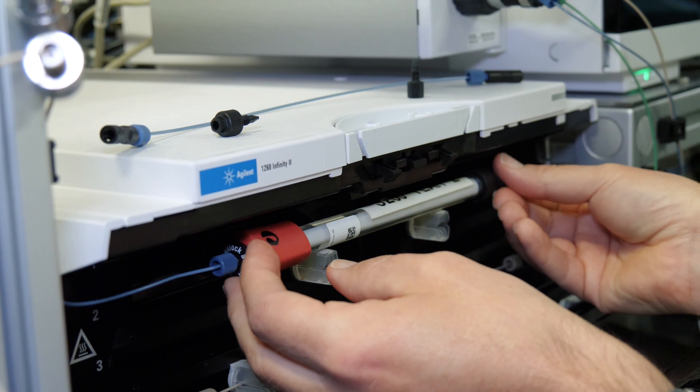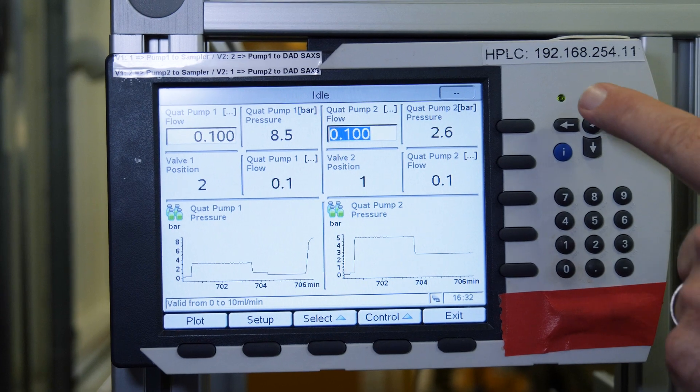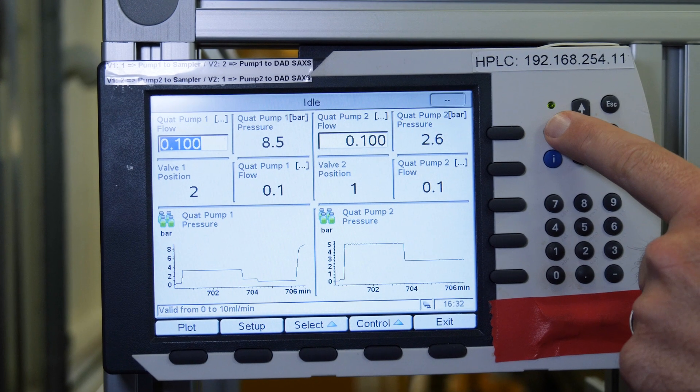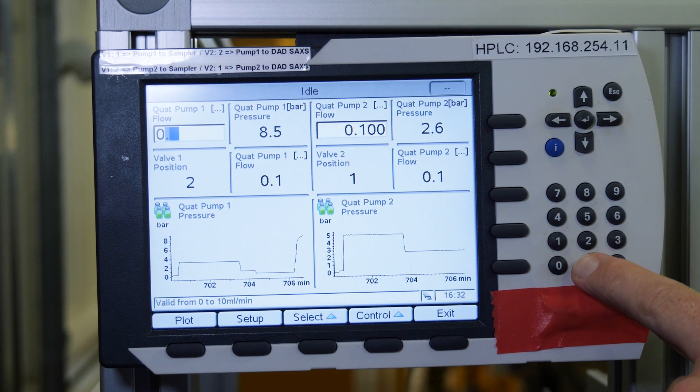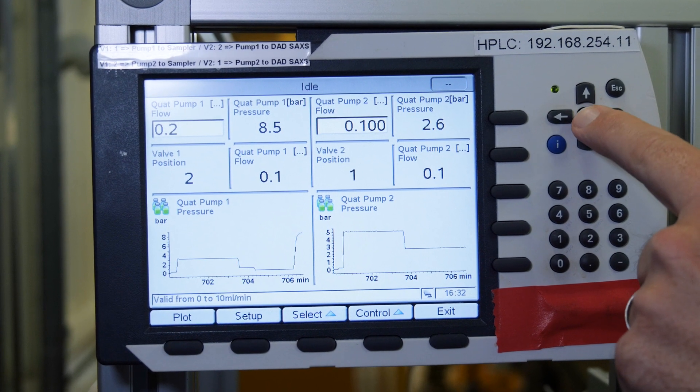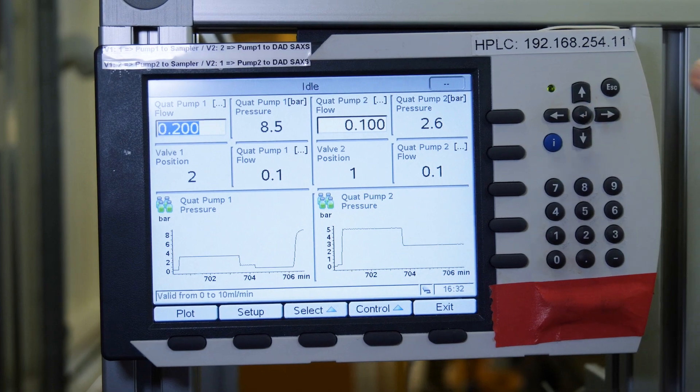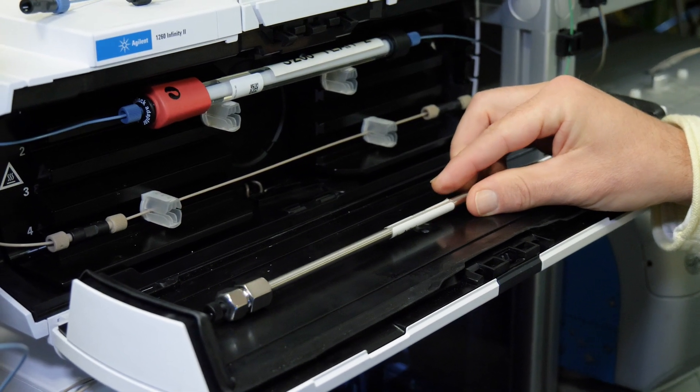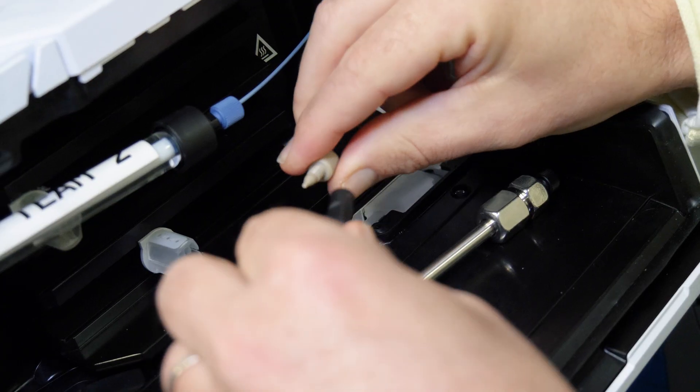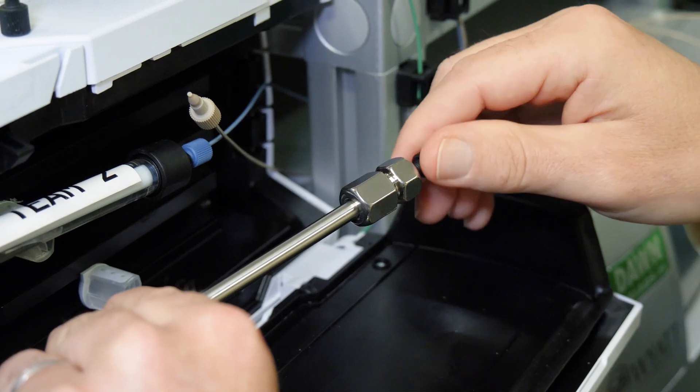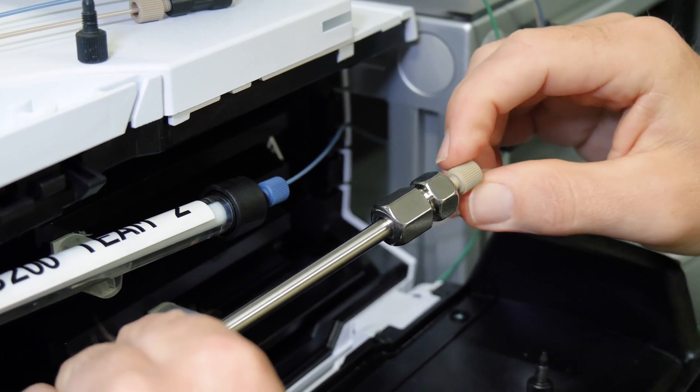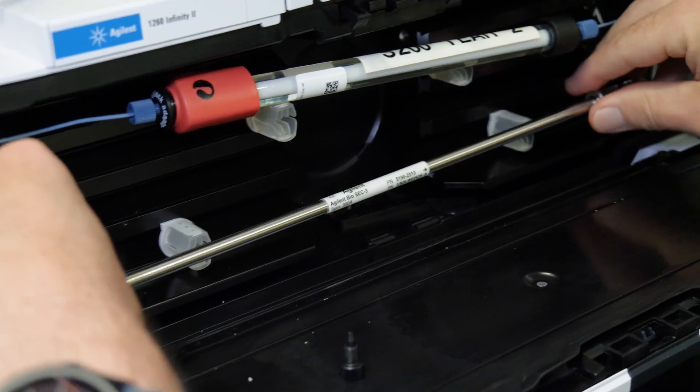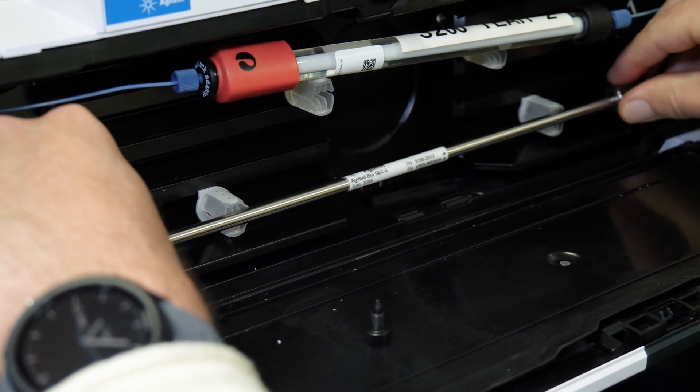Place the column into the temperature control column holder, then set the flow to the desired value. Repeat the same procedure for column two as required.